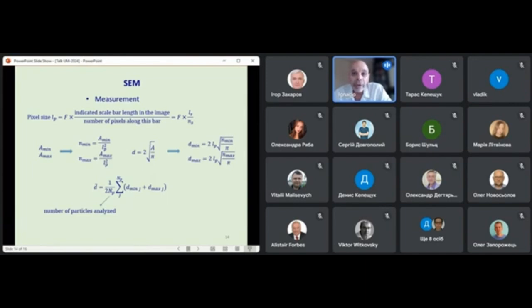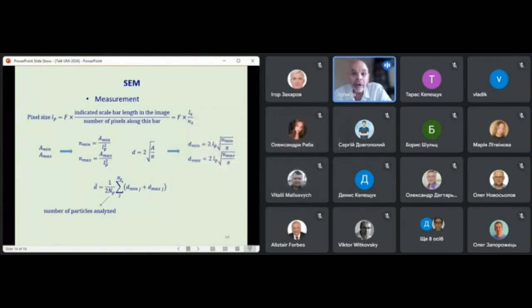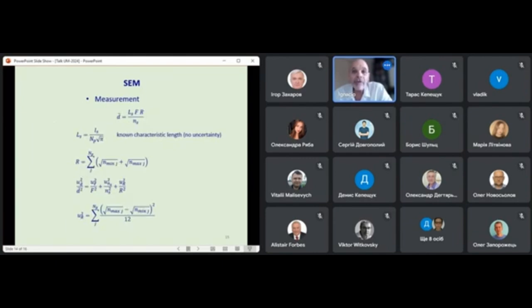So, if one assumes that the images of the particles are circular, we can determine the corresponding model for the average diameter of the processed particles in the sample using these two equations with the square roots. By having the models for the calibration factor and for the measurand, we can put them all together. It is then a rather trivial matter to obtain the uncertainty of the average diameter of the ensemble of each of the particles by applying the Gauss law of propagation of uncertainty.